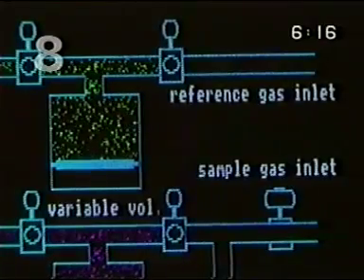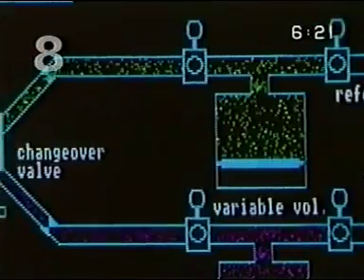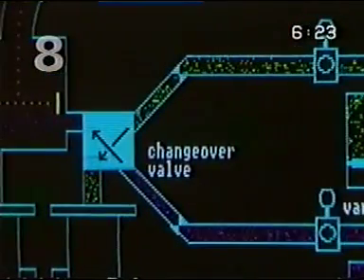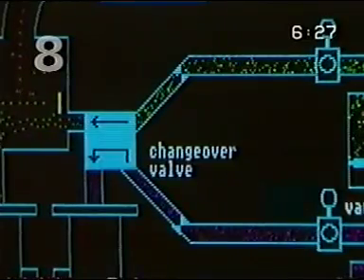The instrument swaps between the sample and the standard on quite a short time scale to obtain what is known as the delta or differential isotopic composition. We need to know this to fractions of a part per thousand. As I have already said, the approximate isotopic composition of oxygen 16 to 18 is about 500 to 1. To understand planetary processes, we really need to know whether this is 499.95 or 500.01 to 1.